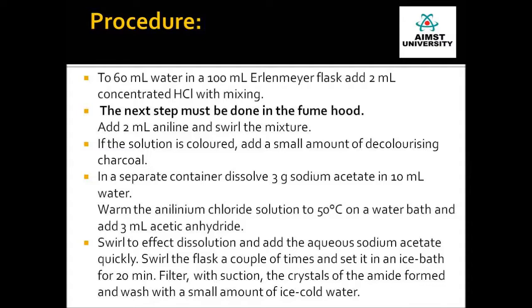Now in a separate container, dissolve 3 grams of sodium acetate in 10 ml of water. Warm the anilinium chloride solution to 50 degrees centigrade on a water bath. Add 3 ml of acetic anhydride. Swirl to effect dissolution and add aqueous sodium acetate quickly. Swirl the flask a couple of times and set it in an ice bath for 20 minutes.